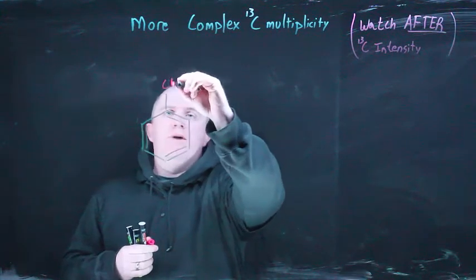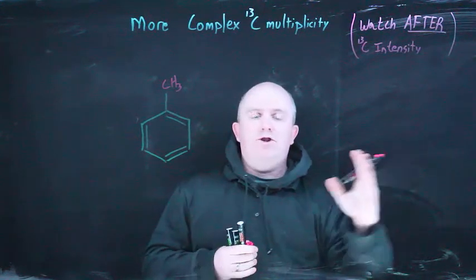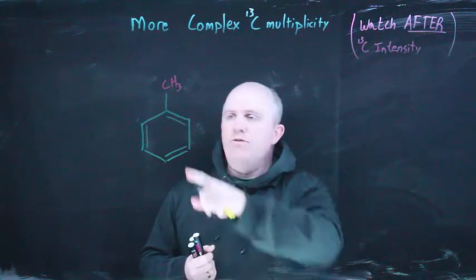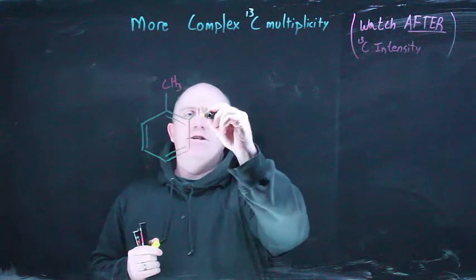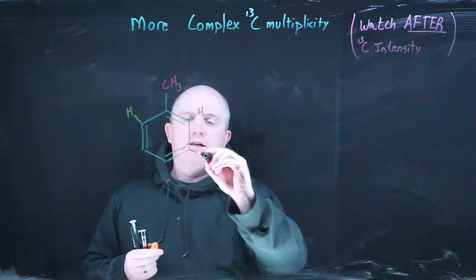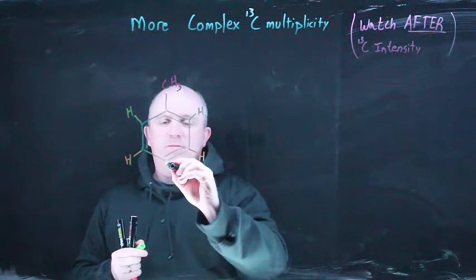There's the carbon of the methyl, of course, and you would expect it to have a relatively boring chemical shift, sort of at the 20 ppm or so, thereabouts. And then we have the carbon on the ring junction itself, which contains no hydrogen. And then you have these 2 hydrogens, which I'm going to color code as yellow. Then, of course, we have the next 2 hydrogens. And then lastly, we have the hydrogen that's on the plane of symmetry for the molecule.